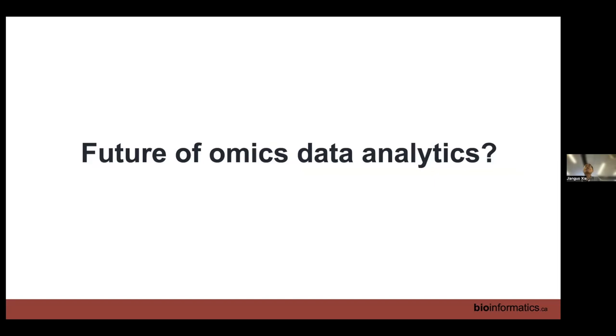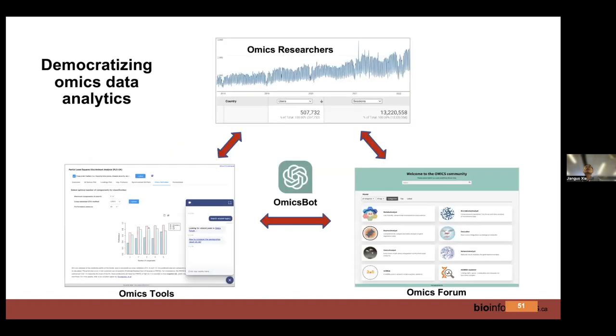So this is the last few slides. And I already mentioned earlier that we tried three-dimensional. We wanted to try VR, but it seems that goggles and VR devices are not ready soon, which I hope is ready now. It's unfortunate they are slow. But now we have new toys and we really want to get into this ChatGPT omics bot, and it seems they are very promising. We can design an interface that allows you to upload and do it, but actually we can do it through conversation as long as they understand what you're doing and confirm with you. And if you're doing something not possible, they will give you a warning, telling you not to do that.